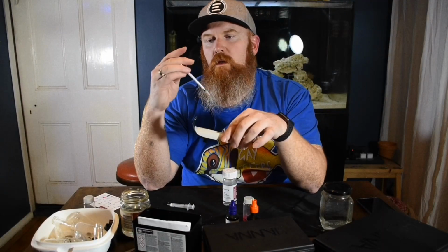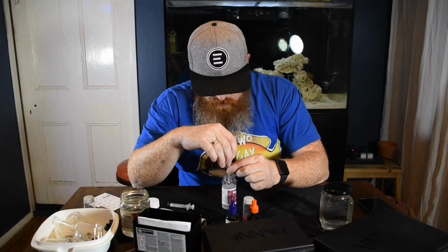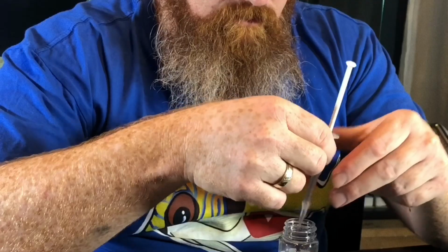Next step, you get your reagent C. You get this little contraption thingy and your 1 mil syringe. I've always struggled with this particular part.